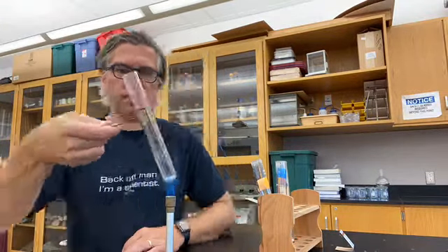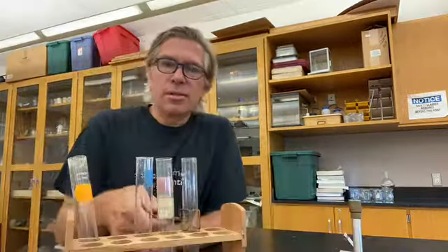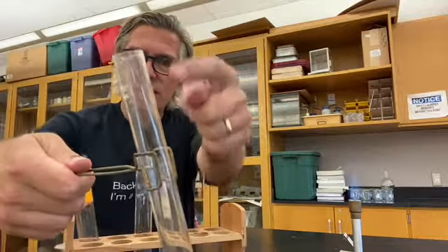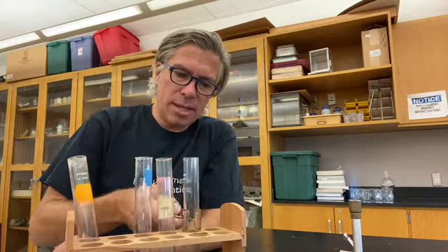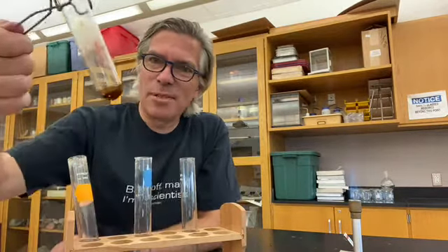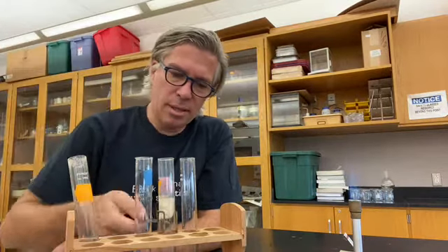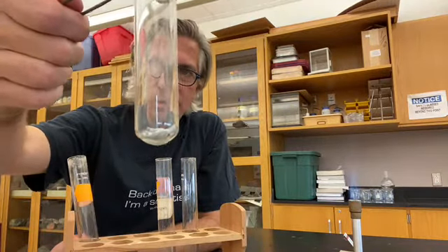Well, we know the paraffin melts really easily, but let's try the other 3, this time in a Bunsen burner flame. So the copper sulfate in the Bunsen burner flame turned almost completely white, and it did not melt, although I did find this water vapor that condensed over the top of the test tube. The dextrose was really exciting. First it melted and then it burned into this lovely brown color. Yes, it's awesome. And once again, zinc not doing anything. It just sat there the entire time.